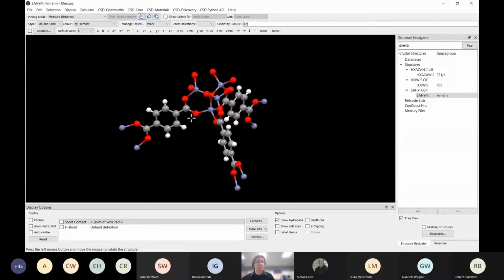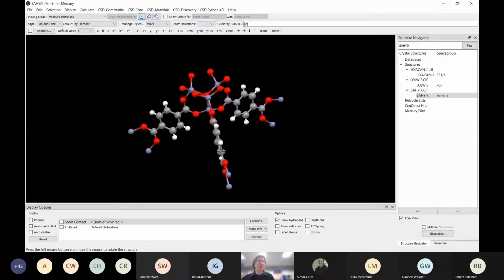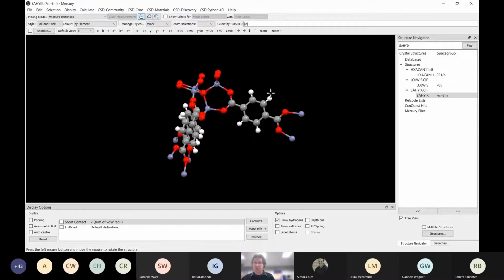But what it does is it grows as fragments, so when you view it visually, you start by seeing the basic fragments. So you expect a whole molecule of the system, and then you can grow it later. So we've done 2 molecules, so let's go on to the third one.